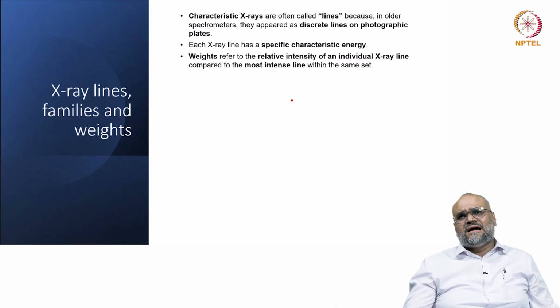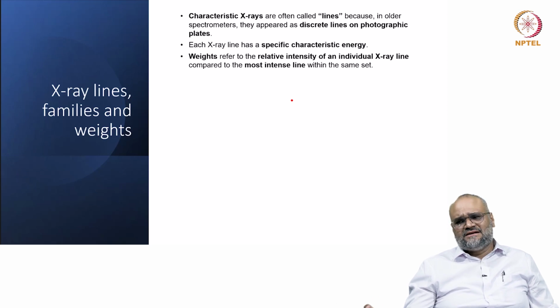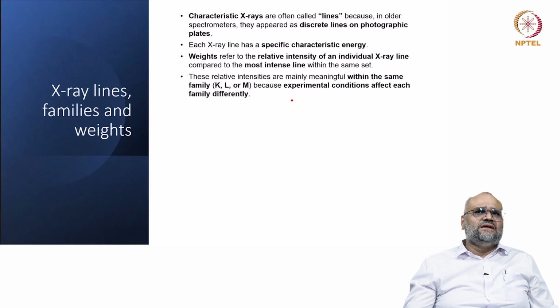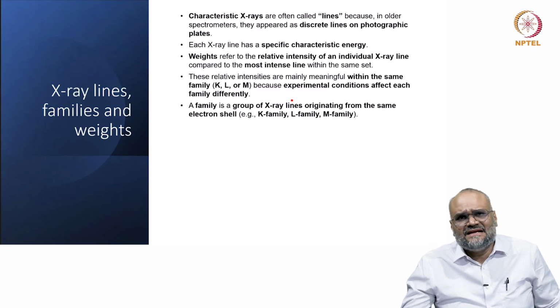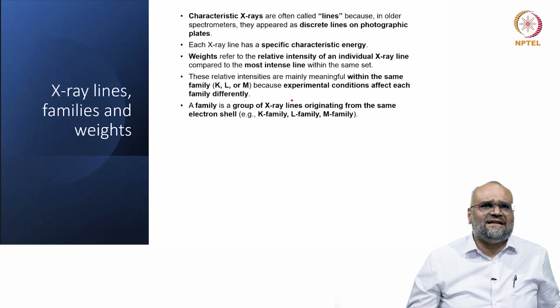If you look at the area under the peaks of each of these characteristic lines, and at the relative proportions of the equivalent weights that are proportionate to these intensities, you can use a simple proportionality relationship, and whichever shell of a specific atom they come from, you can quantify, and this is called quantitative EDS mapping or EDS spot analysis.